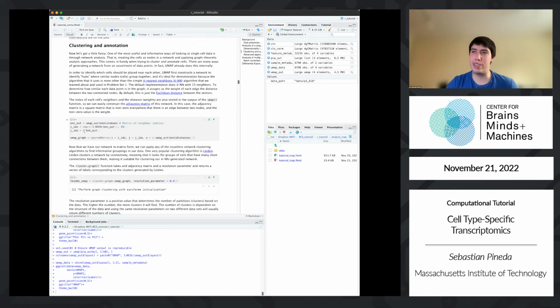Okay. So it generates a graph, and then it uses that graph to optimize the visualization. It's very popular to do these sort of graph theoretic approaches when analyzing single cell data, because you can treat the data as a graph, and that opens a whole world of possibilities in terms of data analysis, if you can encode your data in this format. One of those things is that you can apply all sorts of clustering algorithms. So ask, okay, in this graph, where are sort of the hubs? Where are the neighborhoods of activity or the neighborhoods of information present?